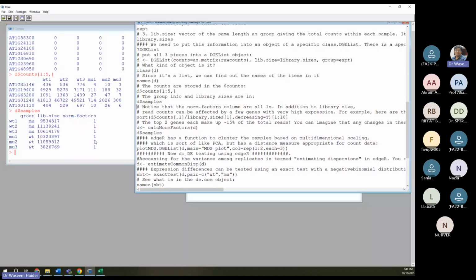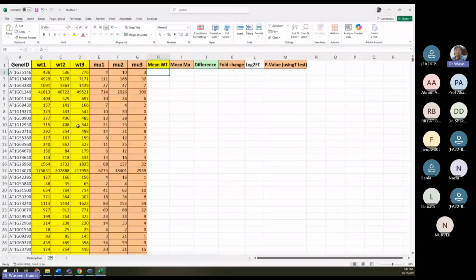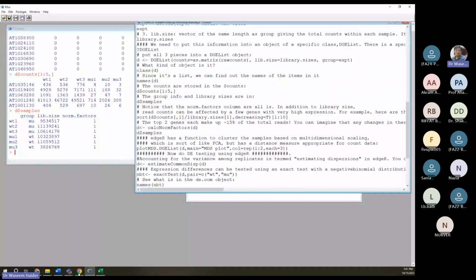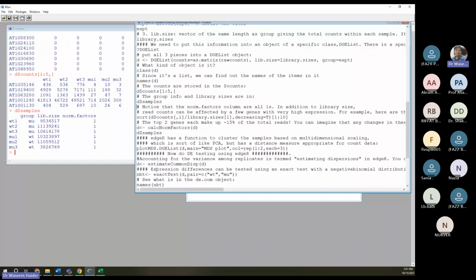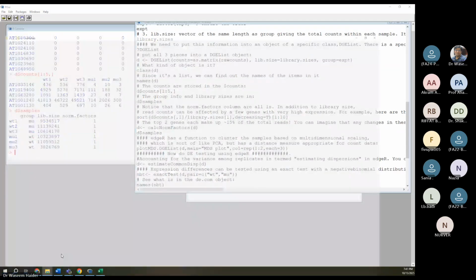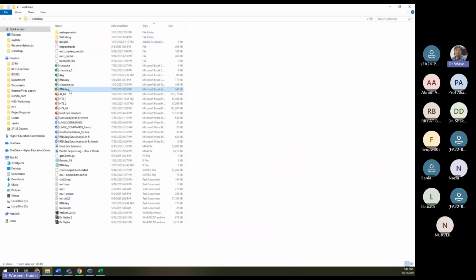No, it's the other way around. So I need to go back and make one correction. The simplest fix is in my CSV file. I think I flipped it around. So where is my CSV file? I can read that CSV again, or maybe I can fix that here in the code. I just figured it out. There is one small error here, so I can just flip it around. Okay.